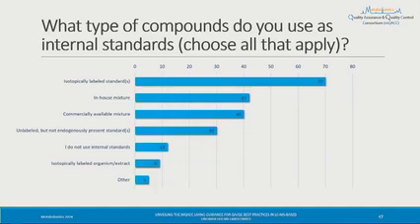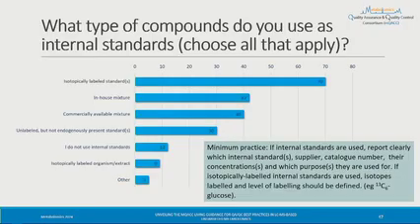And then in terms of mixtures, both in-house and commercial mixtures about evenly split in terms of use, and about 30% is using unlabeled but not present in particular specimens internal standards. And you can see about 12% is not using any internal standards. So we have quite high uptake of the use.